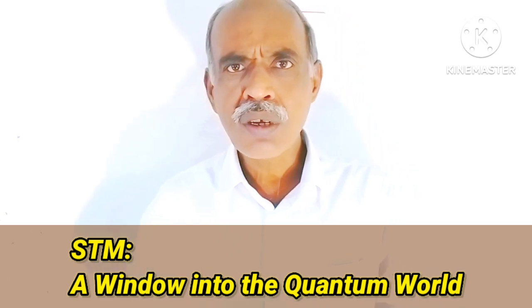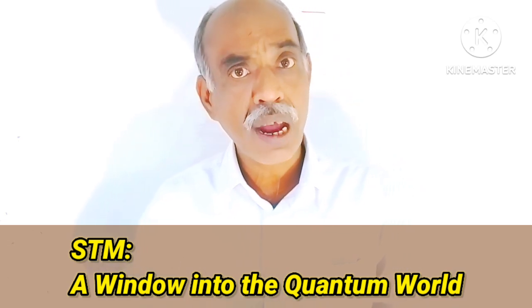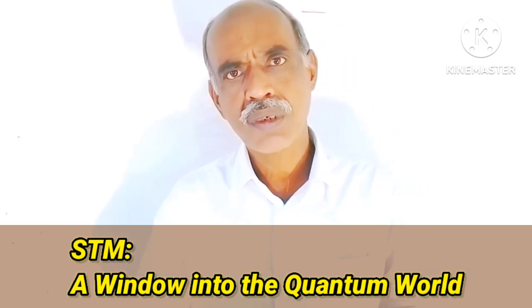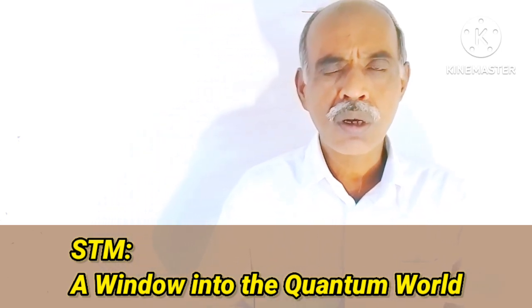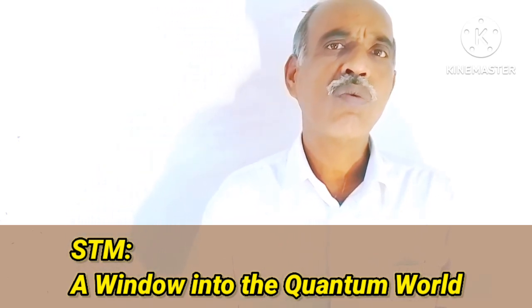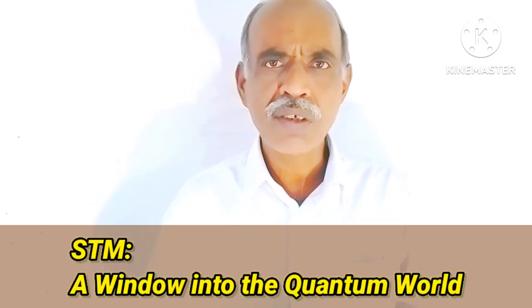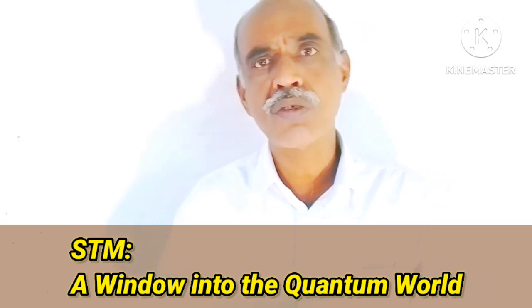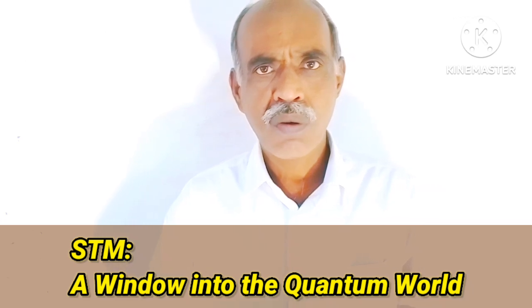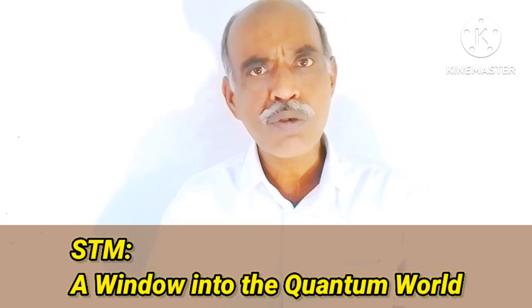In nanotechnology, for the development of nanoscale devices, manipulation of atoms is required, and that can be done easily using this method. Again, in quantum computing, to design and develop quantum materials, this quantum tunneling microscope is used. So in the fields of material science, quantum computing and nanotechnology, this STM can be used. Somewhere it is used to study, and somewhere it is used to manipulate the atoms.